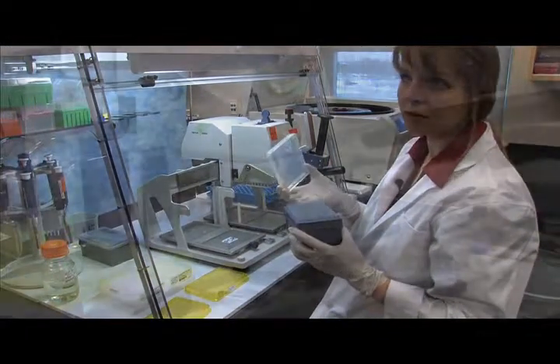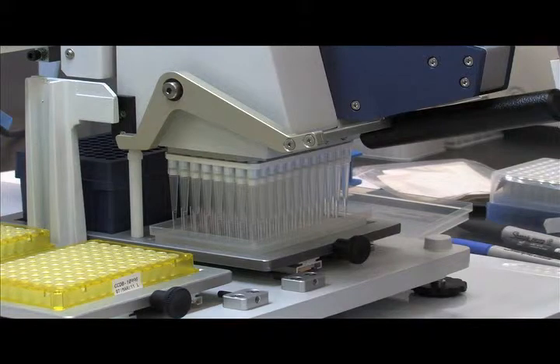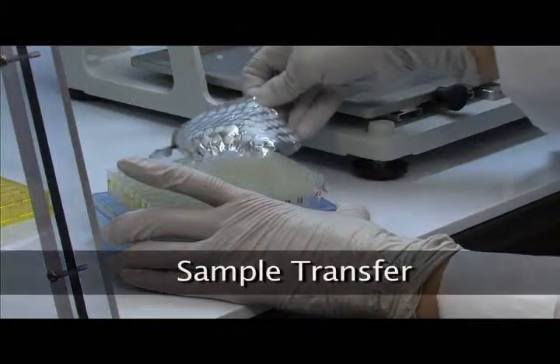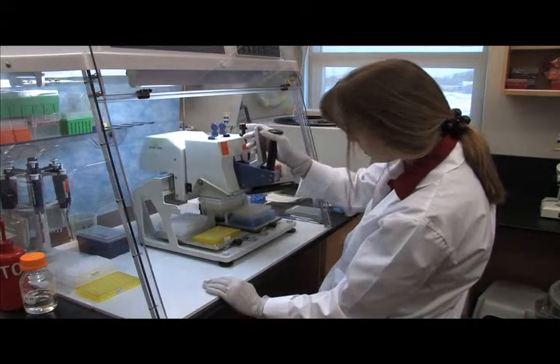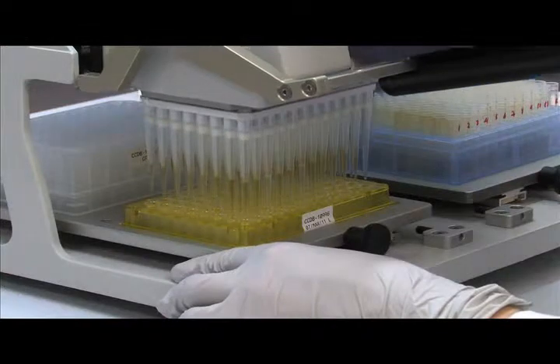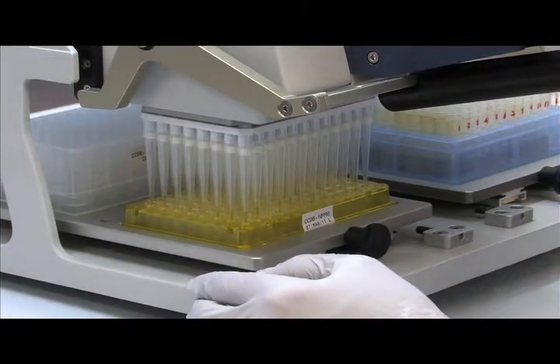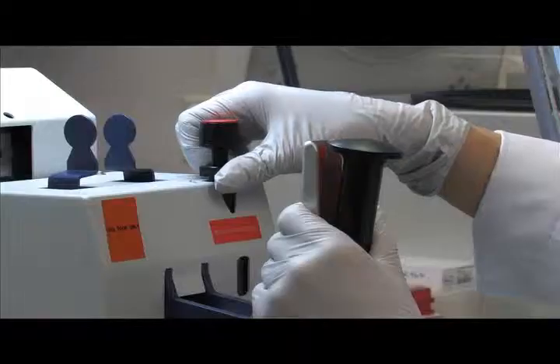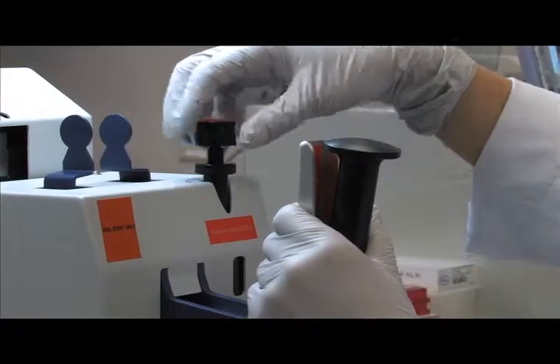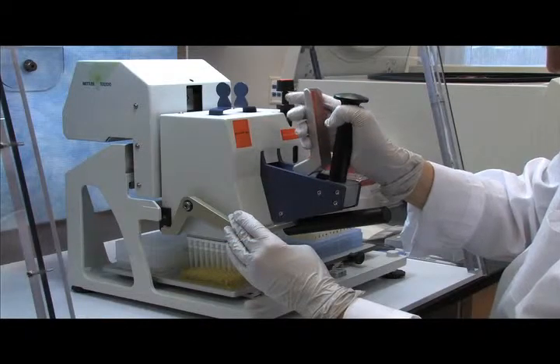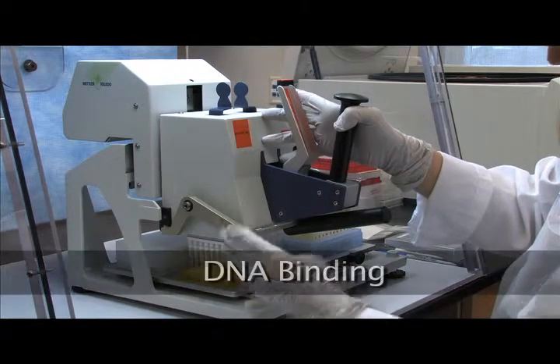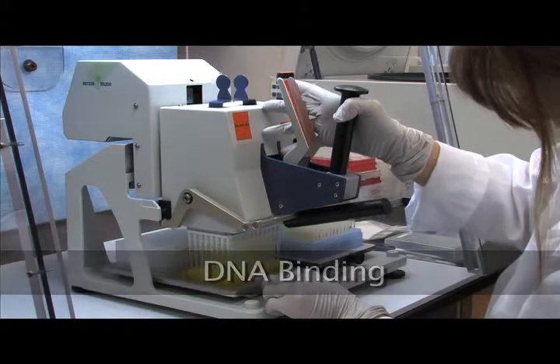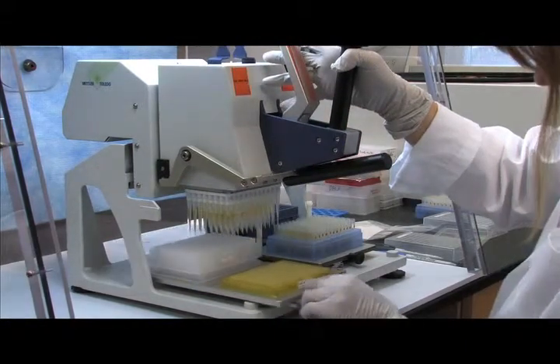Liquidator 96 lid is sterile and hence can be used as a reservoir for various applications. Here is a plate containing tube racks which has plant extract in lysis buffer. 50 microliters of lysate is transferred from 96-well tube rack to a plate containing 100 microliters of binding buffer. Adjust the volume on Liquidator to 150 microliters. And as you see, the Liquidator offers great flexibility to volume adjustments in the middle of sample processing steps. At this point, transfer 150 microliters sample into the 96-well DNA extraction plate containing membrane on the bottom.